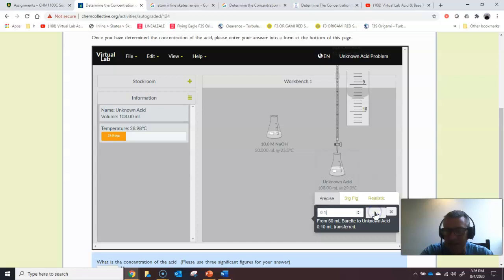Now, see how I'm clicking at this pace? If I go faster, I might do an extra click. Oh, I think I got it. I didn't do an extra click. All right, let's do the math. For this particular case, and nobody used this data, I want you to do it yourself.